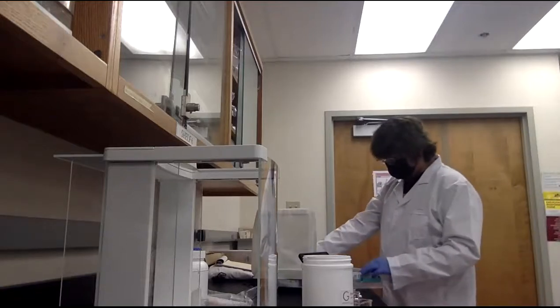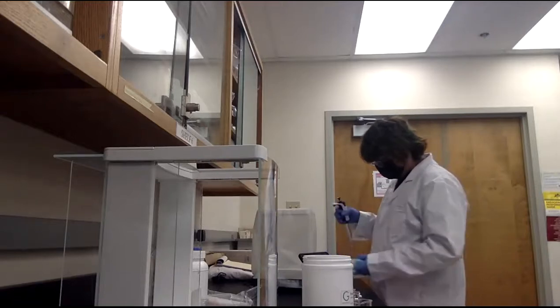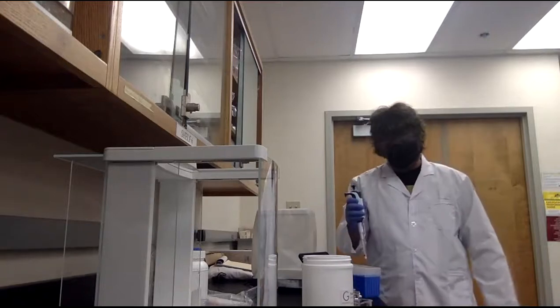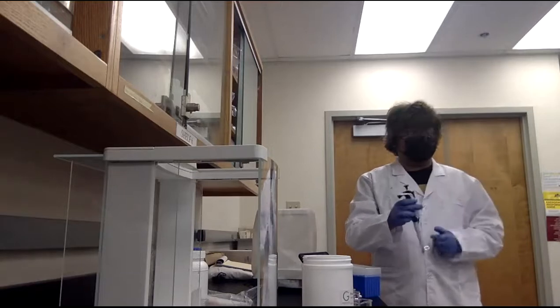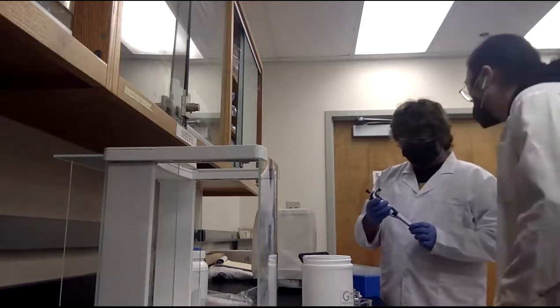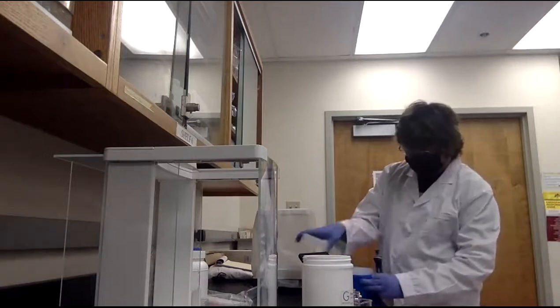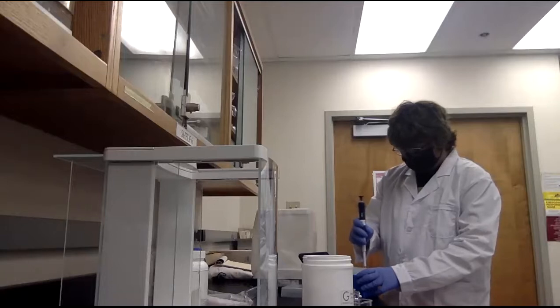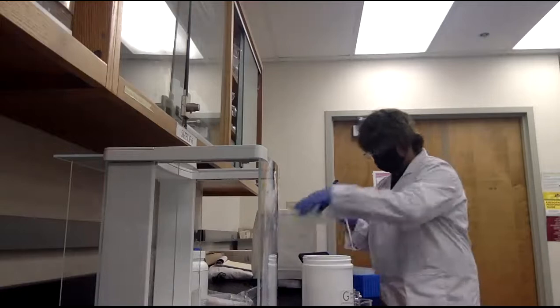Yes. And this is the buffer. This is the strong acid and strong base you need. Do we calibrate this before we get the pipette? You don't calibrate it. You don't have to. So what is the volume right now? It's 1,000. I guess that's exactly what we need, right? You pipette twice, so you get 2 mL. Then you adjust the volume to 800, then pipette one more time. That will give you 2.8.